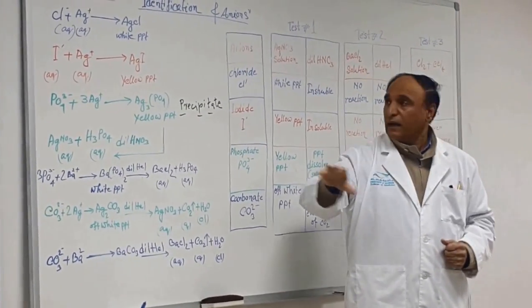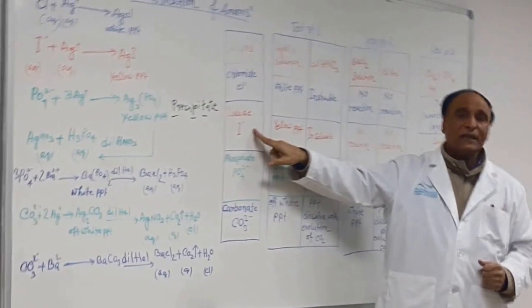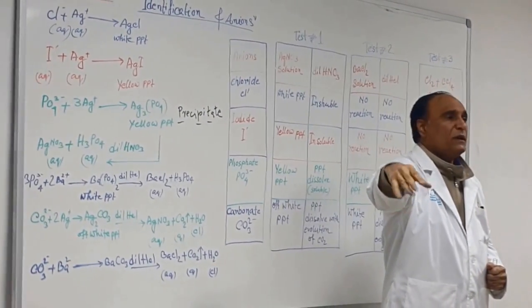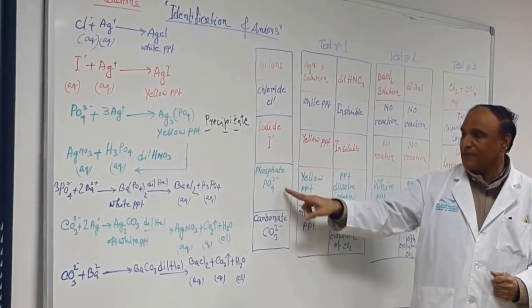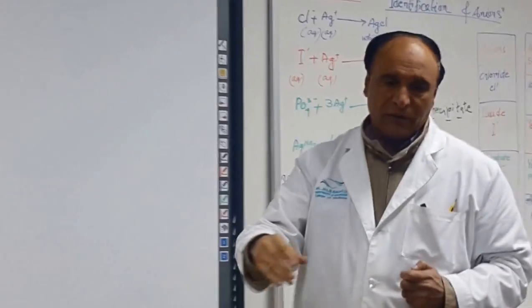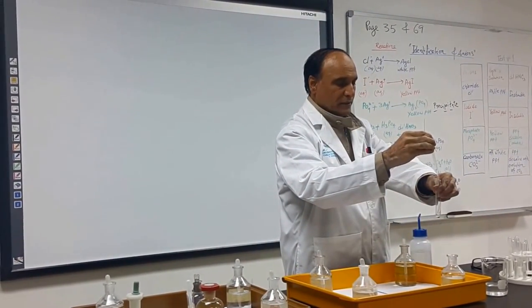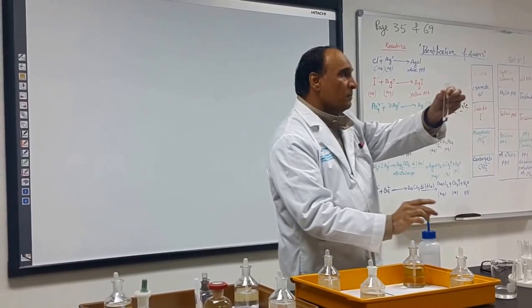Now let's suppose I'm not doing iodide, I will do it later. Let's suppose the iodide bottle is not free, so many students are there. I start with the phosphate. Look over here, I take phosphate. Here is the phosphate, about 1 centimeter cube.